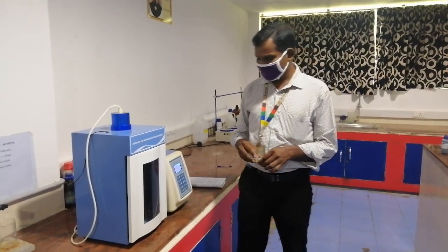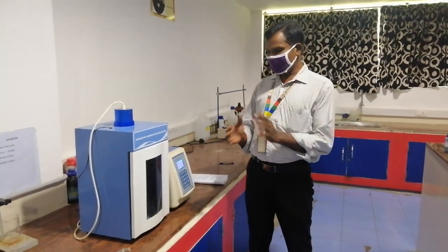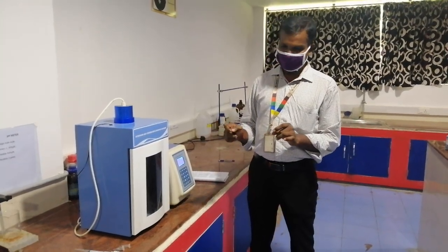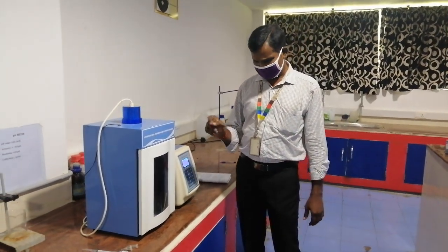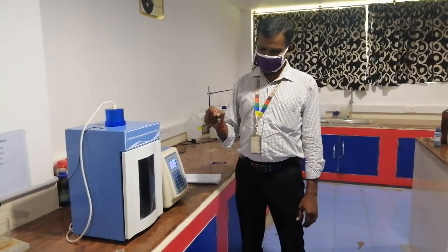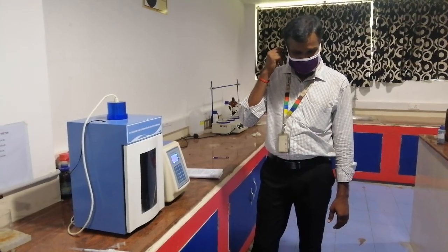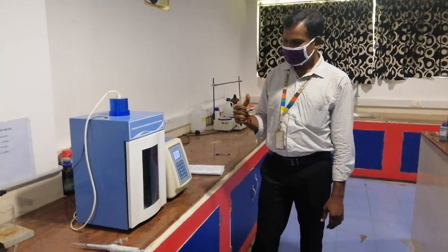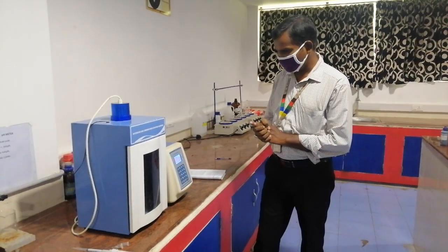That C max can be determined by taking 2 ml of undisrupted cells and mixing it with 2 ml of 0.1 N sodium hydroxide. So boil this mixture for 10 minutes. And then take 0.5 ml of this sample, centrifuge it, and then find the protein concentration present in your sample using the Bradford assay. Using a standard, you can convert this concentration into mg per ml. That is C max, which is obtained after cell disruption using sodium hydroxide followed by boiling. So that is C max.